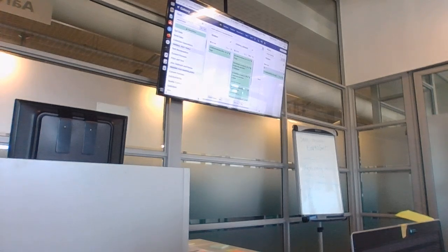So switch to. Oh, you are. Try again. One step. Oh no, but you need to drag this one here. And then I click here.